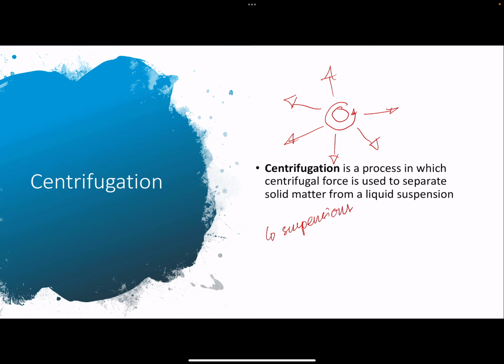However, if you're going to be separating a homogeneous mixture, this is not going to be useful because these solutions are dissolved into each other and are chemically bonded. So even if you centrifuge the solution for a whole day, you're not going to be able to separate mixtures that are dissolved. So this is particularly useful in suspensions. You could also use it for colloids, but that is not our application in the laboratory. So centrifugal force is employed, and that's why it's called centrifugation.